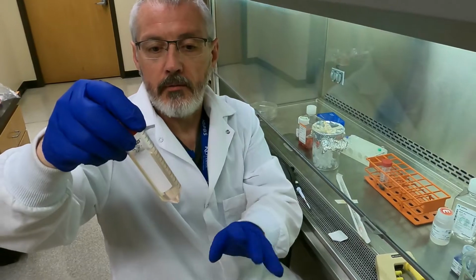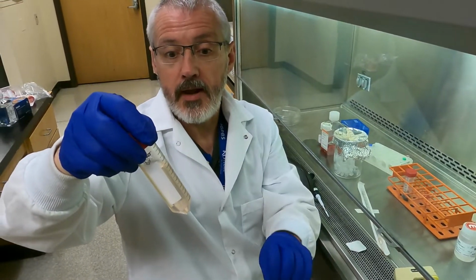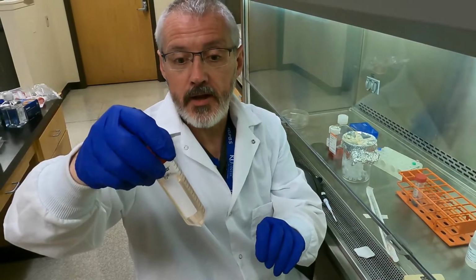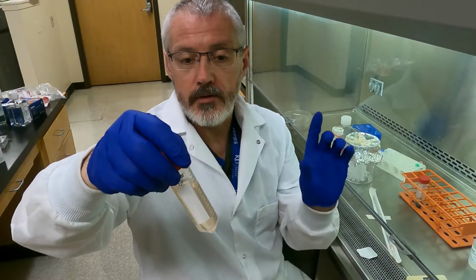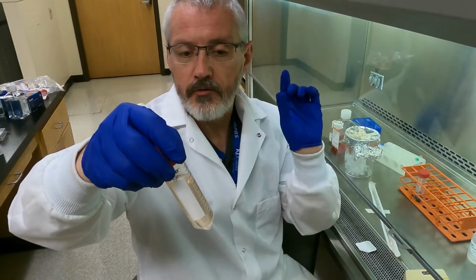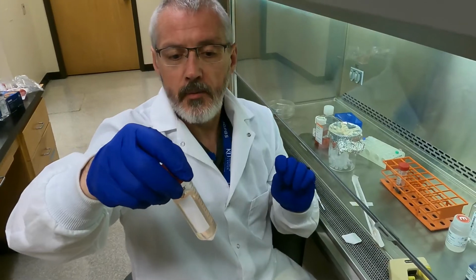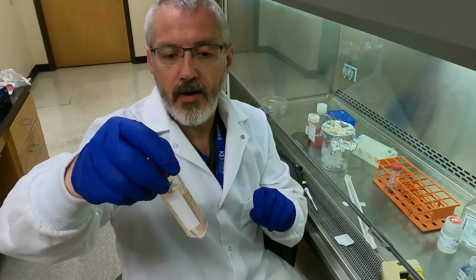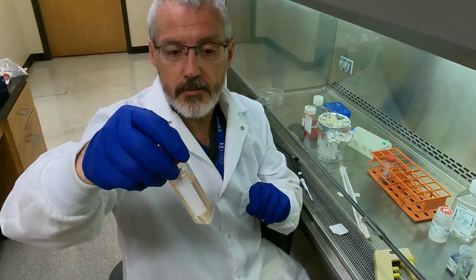And then we're going to count them, do a trypan blue. And then we're going to spin them down again and take them up in PBS again, and then take some of it and put it into an Eppendorf. Very quickly spin that down and take it up in buffer R for electroporation. And we need a concentration of about 5 times 10 to the 6 cells per mil in the buffer R.